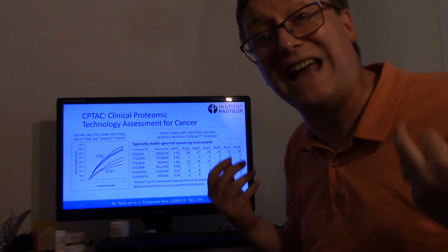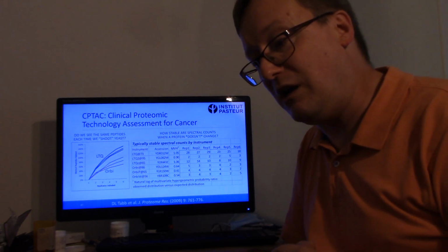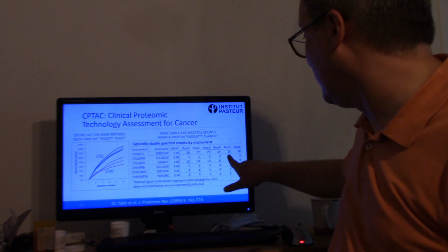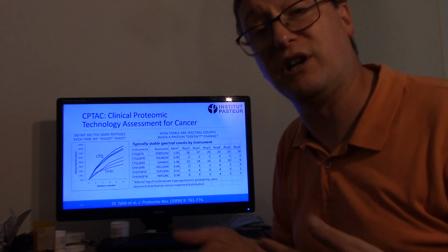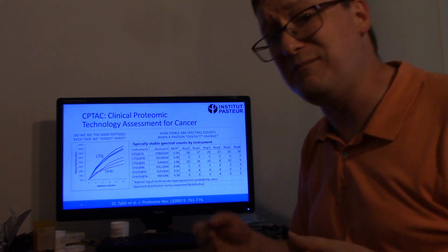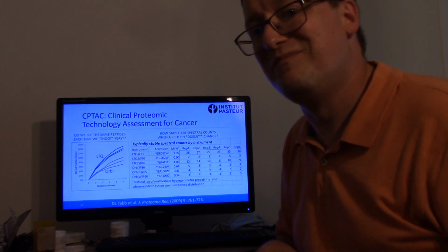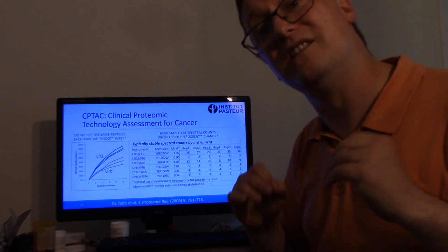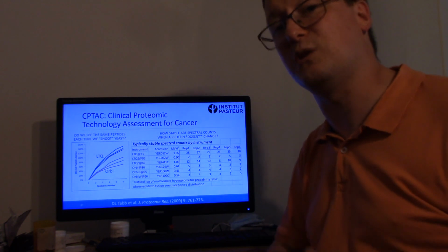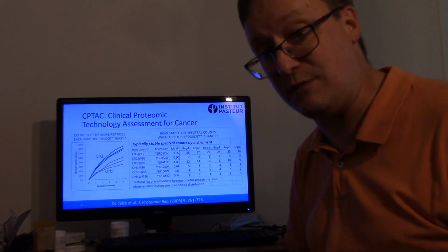Stuff like this is going to happen because of random effects. If you were to be looking for a biomarker and replicates 5 and 6 represented cases and the other 4 replicates represented controls, you might be tempted to say, well gosh, it's always higher in cases than in controls. But in this case, we know it's a completely spurious amount of variation. This is a typical amount of variation to expect for proteins being sampled repeatedly through LC-MS-MS experiments.